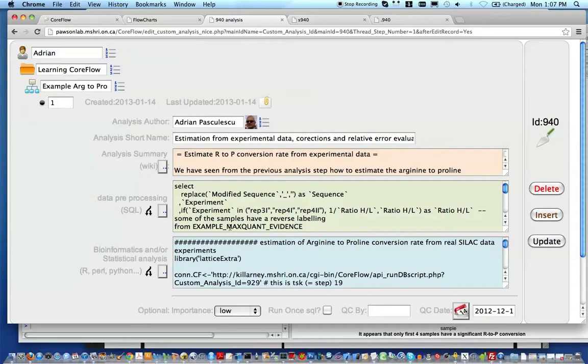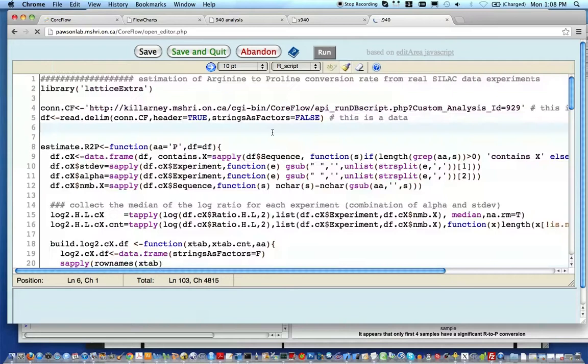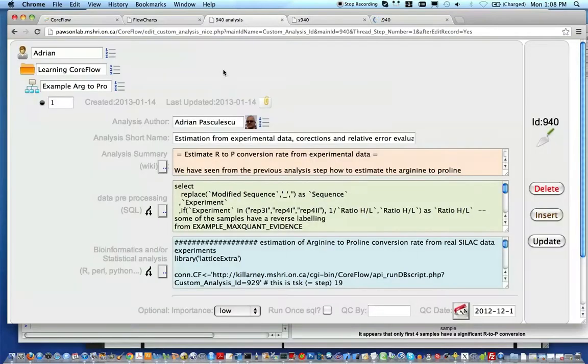The only thing that is maybe missing right now is to show you how we can attach files. So such a result that you have seen, for example, by running this application, this script, and which is generated here, can also be attached to our task.